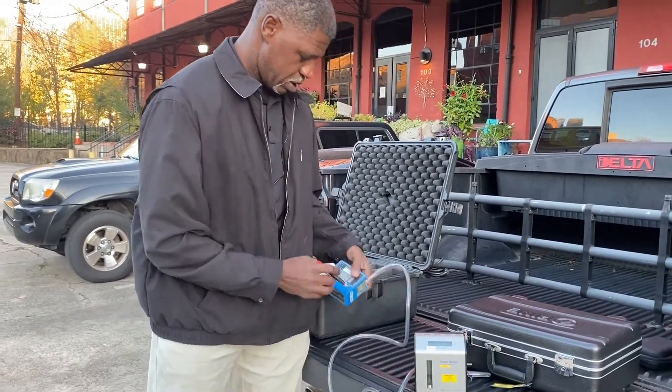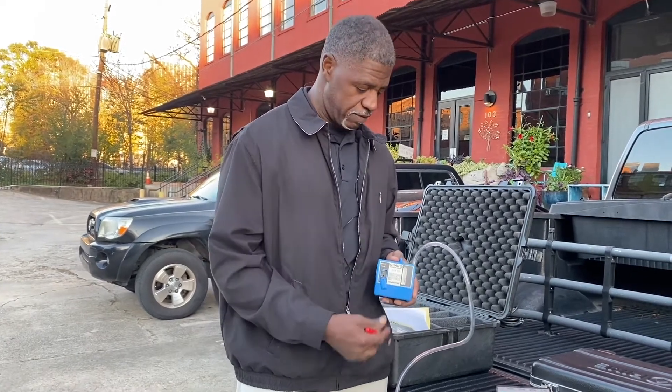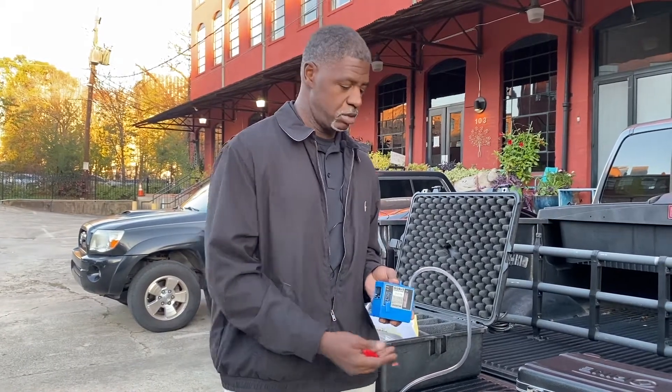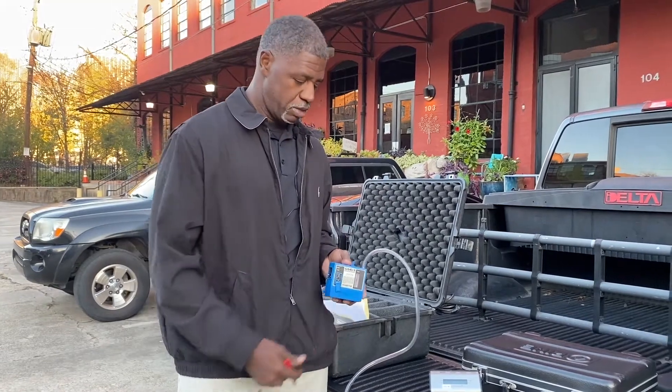Another thing to note: you want your pump to run for a while — at least a couple of minutes to warm up — so it's going to have a consistent flow. This consistent flow should be maintained for at least an eight-hour shift. Up here, the battery light when green will easily give you eight hours at this flow rate. What we do is a pre-calibration, and then at the end of the shift or when you get back to the office, you do a post-calibration. You take the average of those, and that's your flow rate for the sample.